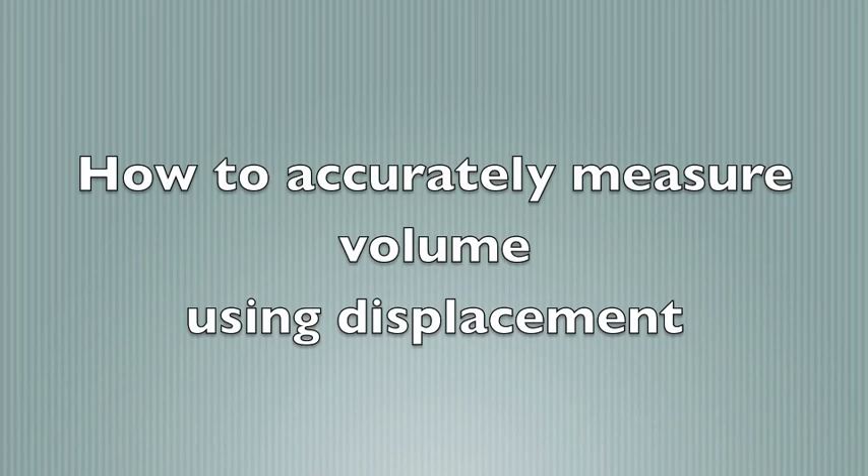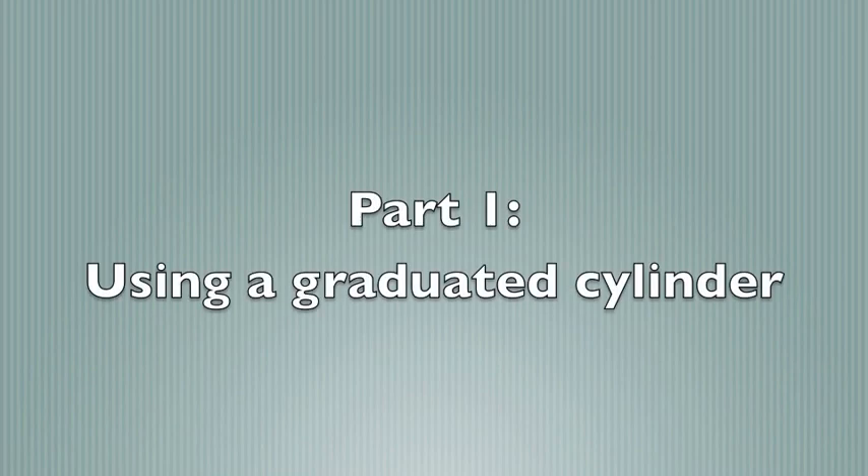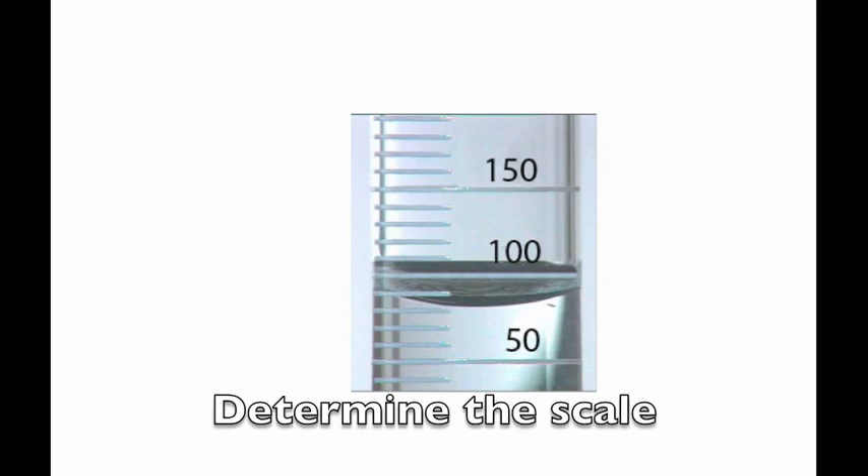Here's how we can accurately measure volume using displacement. But first, we need to learn how to use a graduated cylinder correctly. The first step is to determine the scale. To do that, we pick two points, like 100 and 150 milliliters.